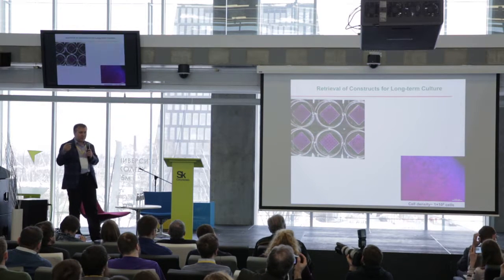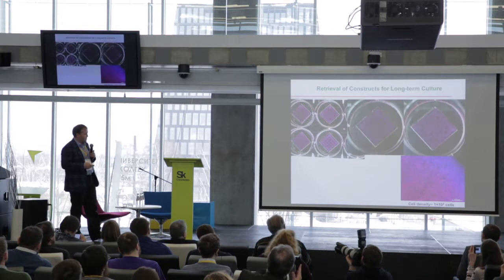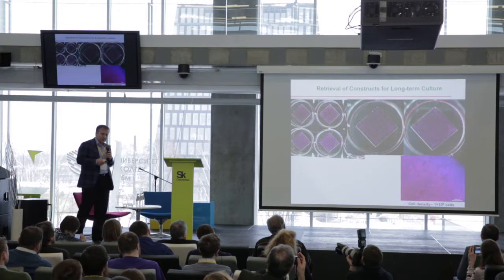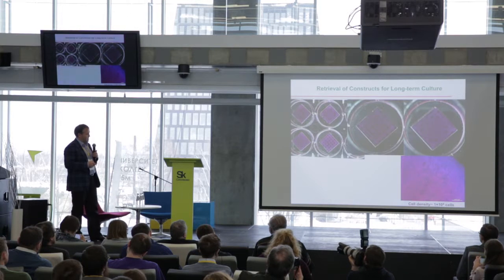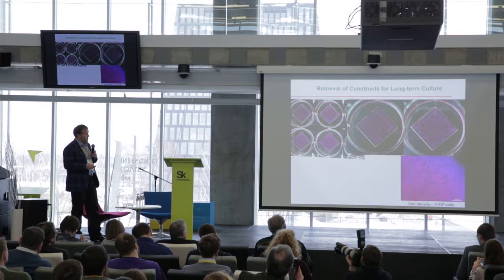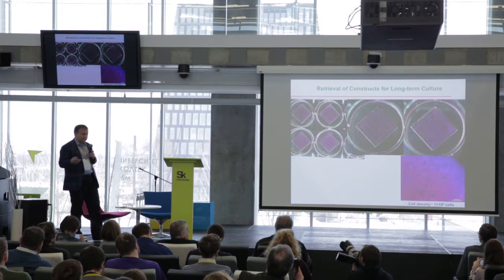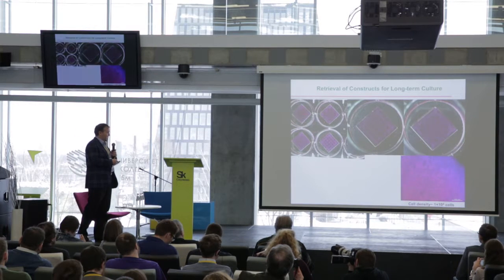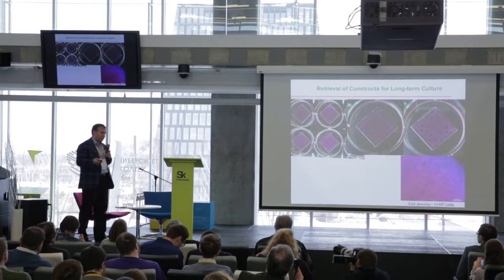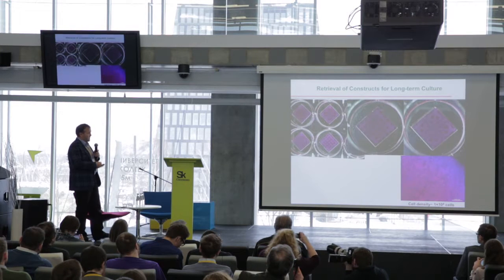Can you recover them? So we came up with different approaches, as Dr. Mironov said. These are standard hydrogels that we use. We have, for instance, here fibrin, which is chemically cross-linkable. We know it's about 10 minutes for the fibrin.